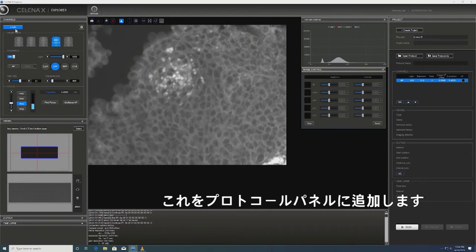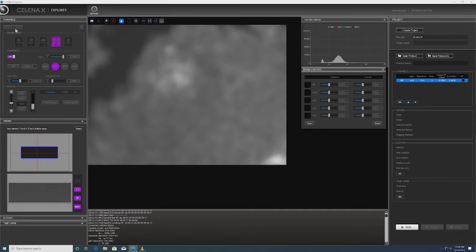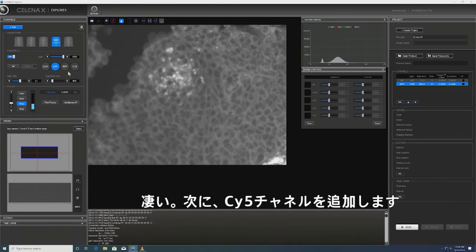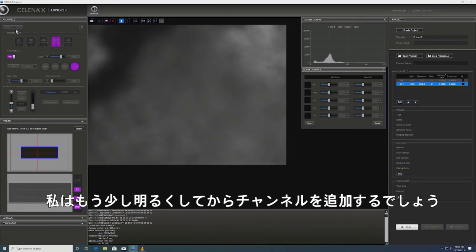I'm going to add that to our experiment panel. Great. Now we're going to add Cy5 channel. Maybe I will make it a little bit more intense and then add a channel to it.